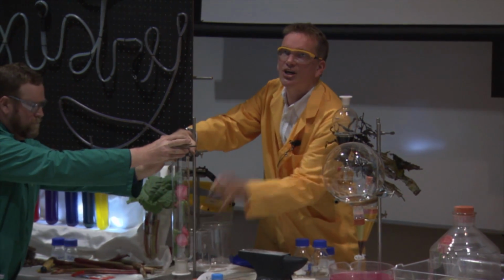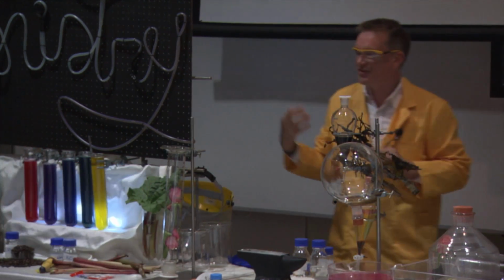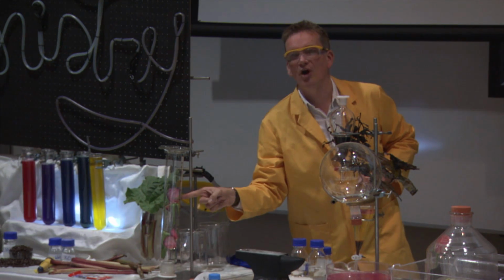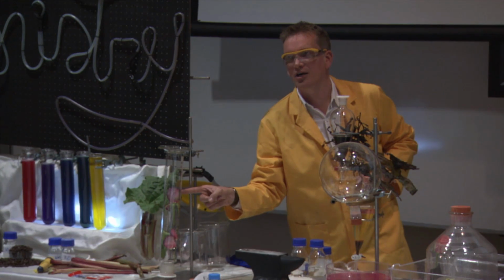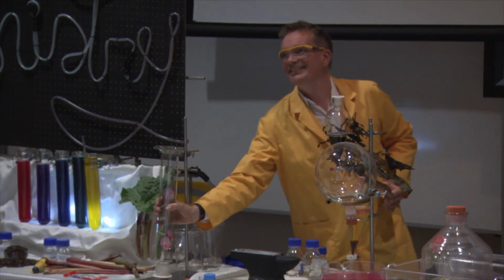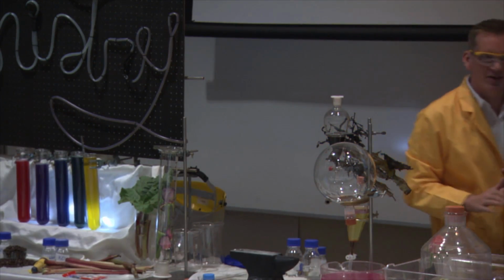And remember, the colours of the roses are due to these dyes, these anthocyanins, and they react and change colour. And the poor little rose here, you can see, is changing, and it's getting darker and darker. Okay? So the rose here is acting as an indicator. It's reacting with the ammonia, showing that it's not very acidic.